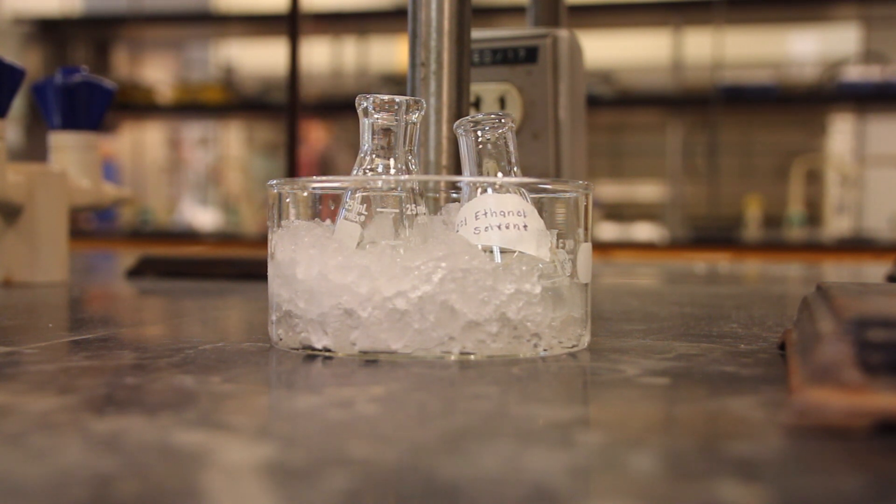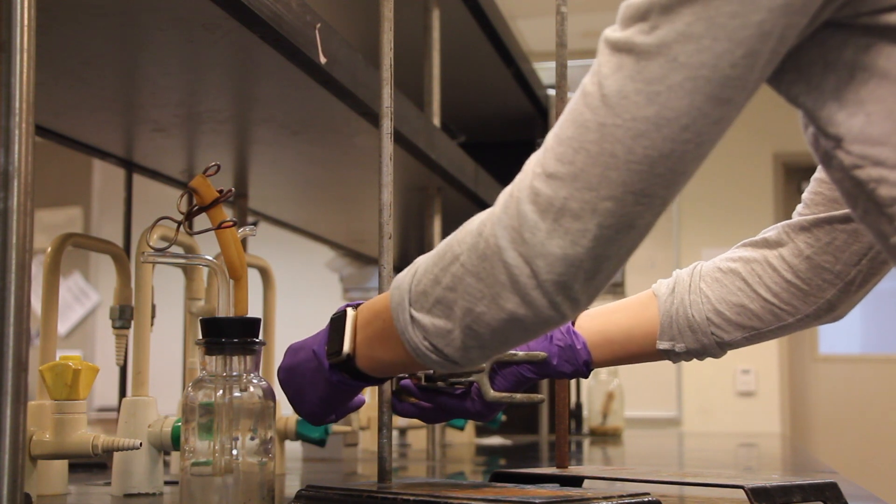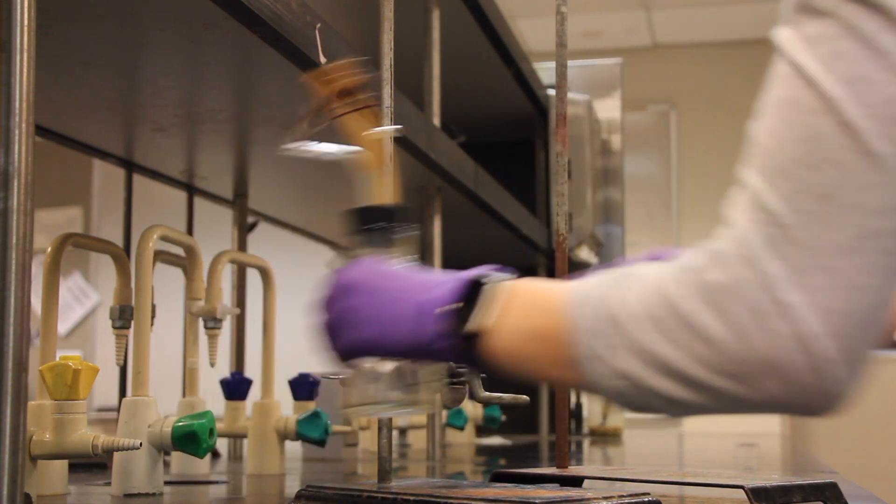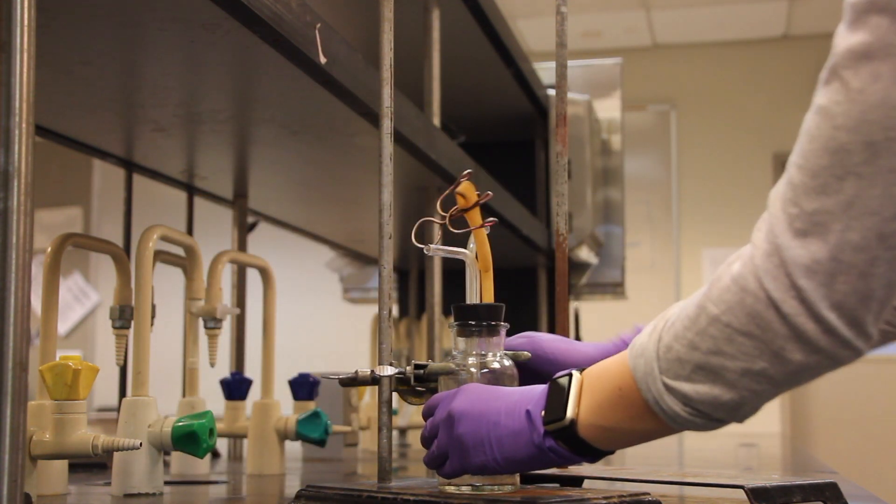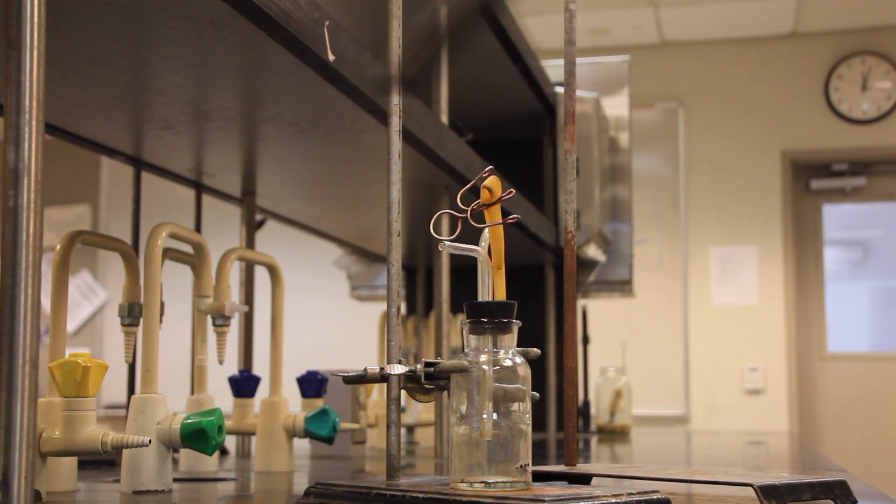We are going to be using suction filtration to isolate the solid product. To begin setting up our vacuum filtration, we will clamp the safety flask in place. Next, we will connect the thick-walled vacuum tubing to the safety flask.